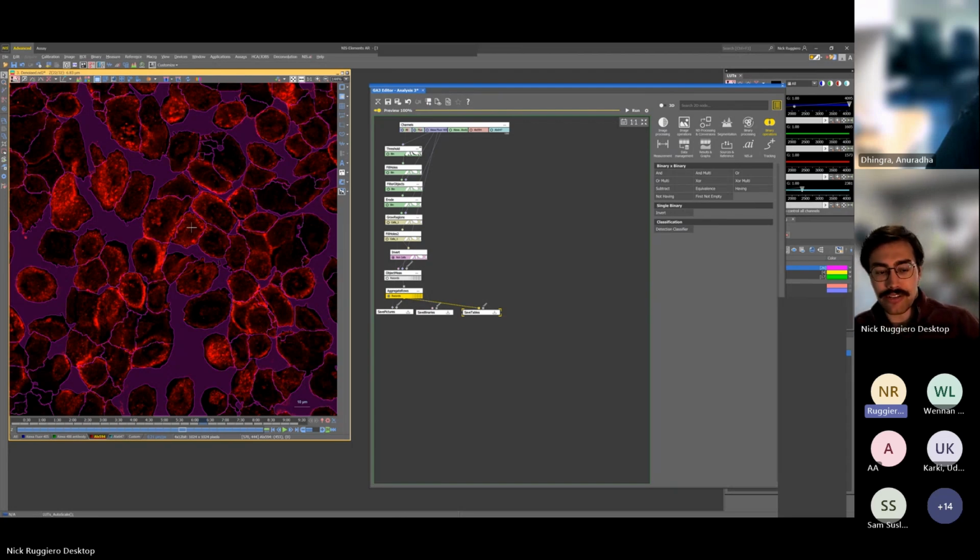We had thought about a lot of different ways of trying to measure all the individual lines between cells. And it ended up, this was kind of the best way to do it. So I don't know if that sort of makes sense.